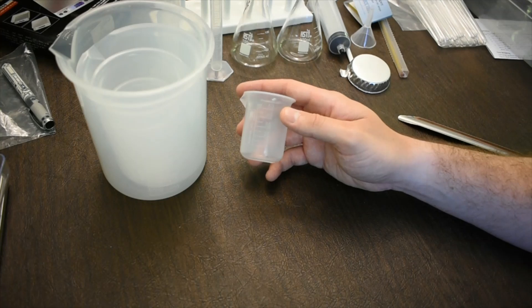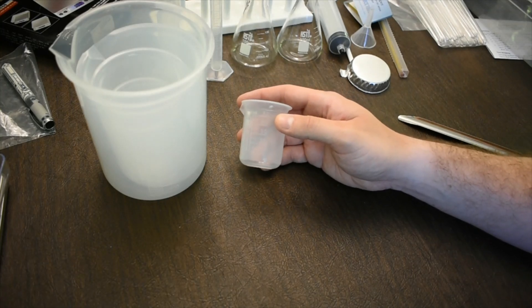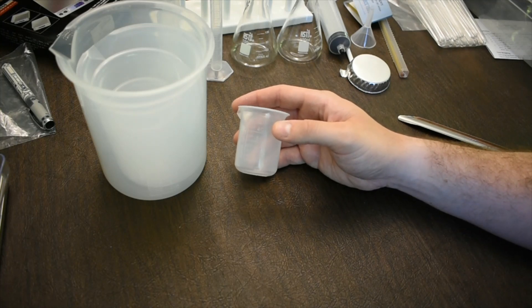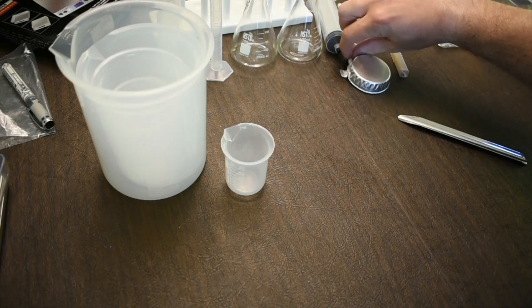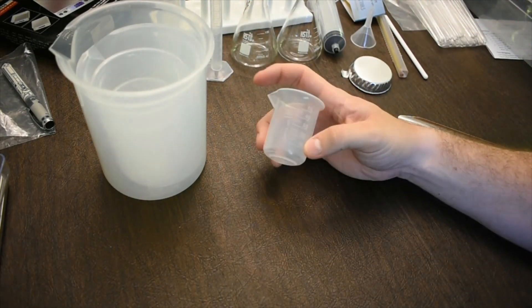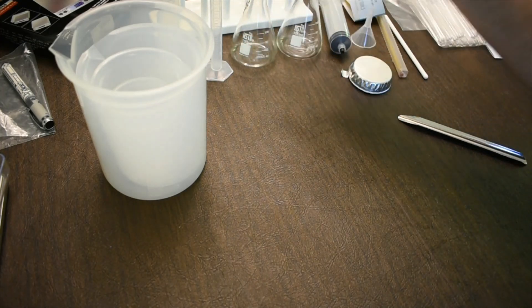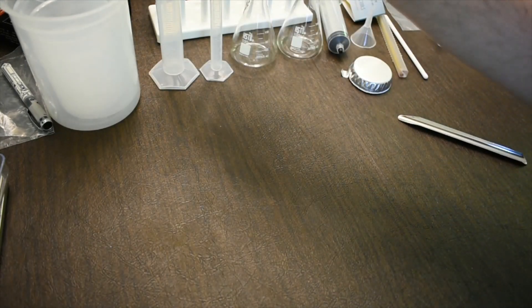The graduations on the beakers are not very accurate, so we're not going to use them to measure actual volume. Instead, we'll use the graduated cylinders to measure volume. The beakers are useful as a utility container — for stirring a solution, for example — and they have very nice pour spouts which allow you to transfer a solution into an Erlenmeyer flask or a graduated cylinder.